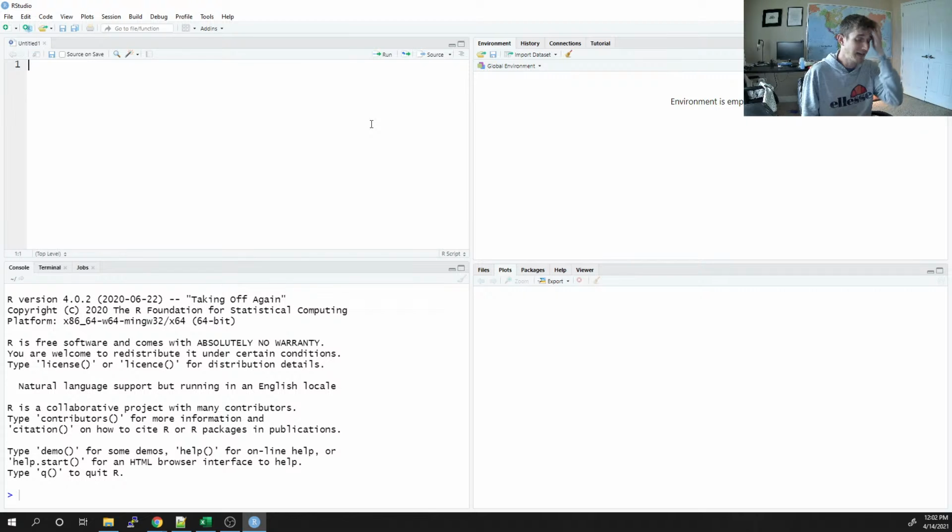Now, it's tricky to read the manual. The actual DESeq manual is not exactly a fun thing to learn and read through. Honestly, I did this same course in the spring last year, and there is another video from the spring 2020 semester that is effectively the exact same video.